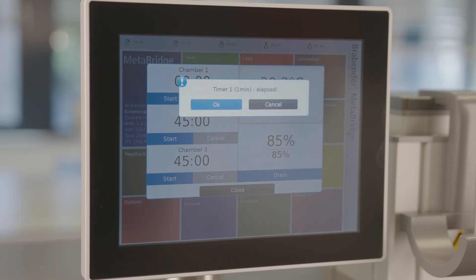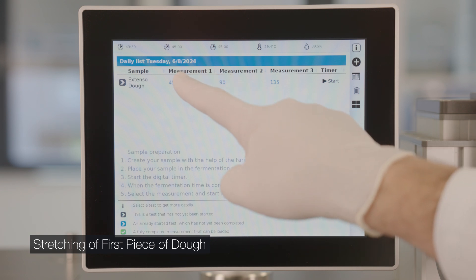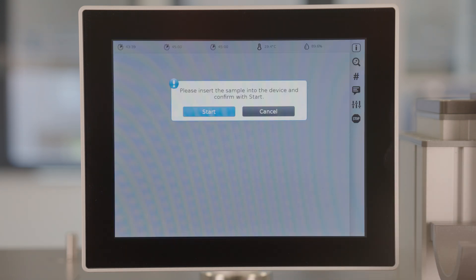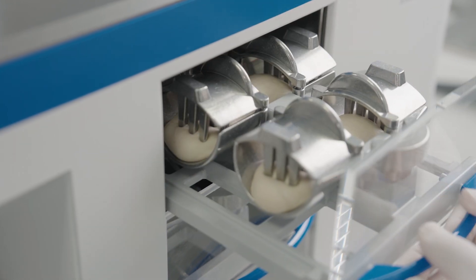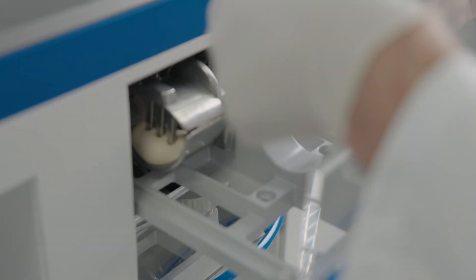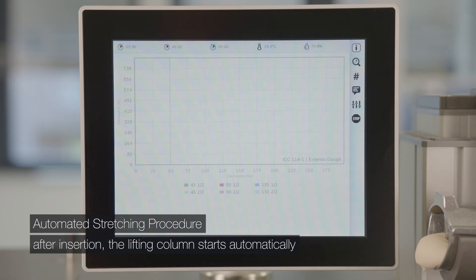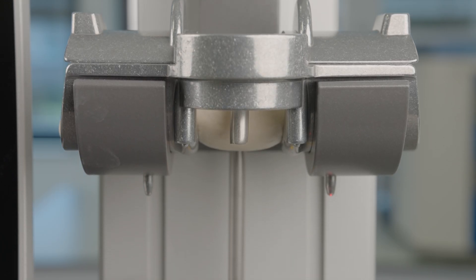When proving time expires, select measurement and tap start. Insert sample into stretching device and tap start again. The dough is stretched until rupture.